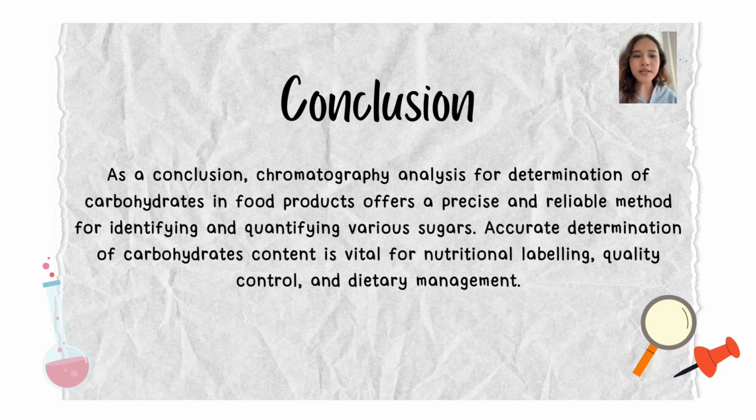As a conclusion, chromatography analysis for determination of carbohydrates in food products offers a precise and reliable method for identifying and quantifying various sugars. Accurate determination of carbohydrate content is vital for nutritional labeling, quality control, and dietary management.